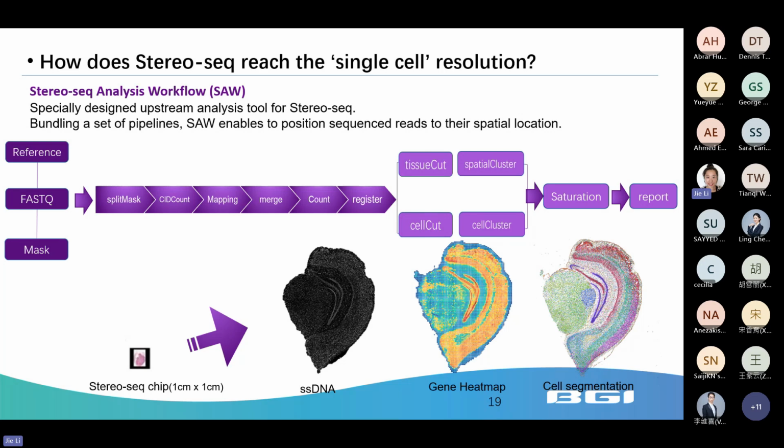And in these pipelines we have 13 essential pipelines as well as other supplementary tools for supporting various analyzing contents as well. So here are listed the different pipelines to do our standard analysis.